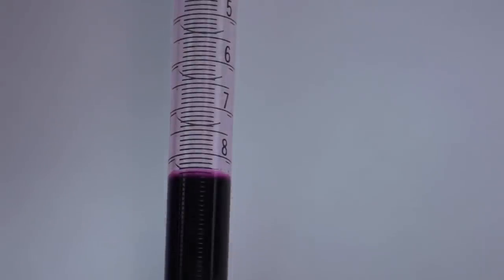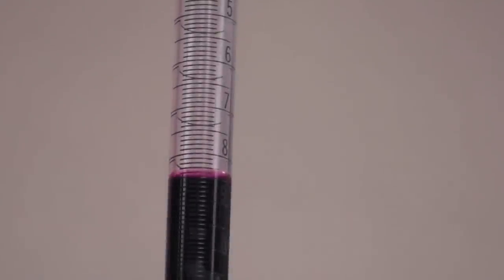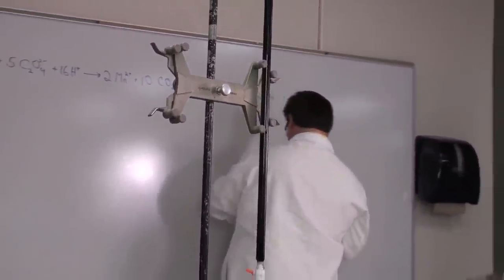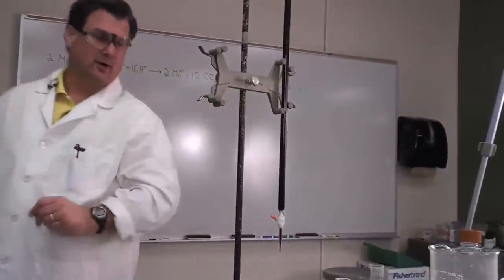In this particular titration, I'm actually reading at the top of the liquid level. Normally you're taught always read volumes at the bottom of the meniscus. Because our solution is a dark purple color, it's very difficult to see the bottom of the meniscus, so we're going with the top of the solution. But I'm going to go with 8.31 milliliters. Let me write that on the board so we don't forget—we'll need that later. You, of course, would be writing this in your notebook.